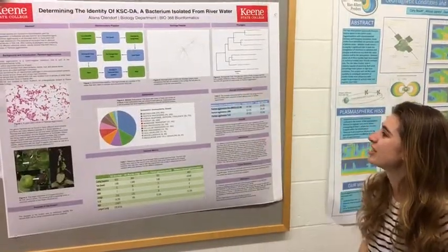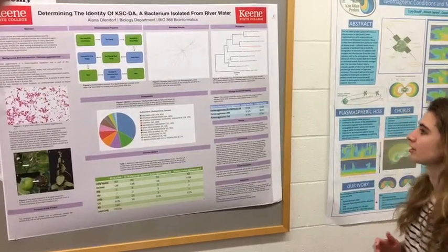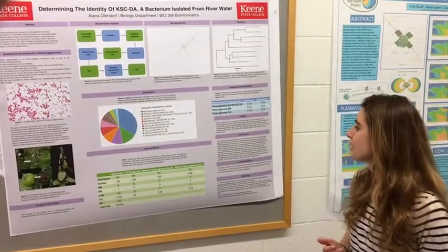This figure shows a Bandage graph, which shows connections that usually you can't see between the contigs, and it allows you to visualize the de novo assembly.